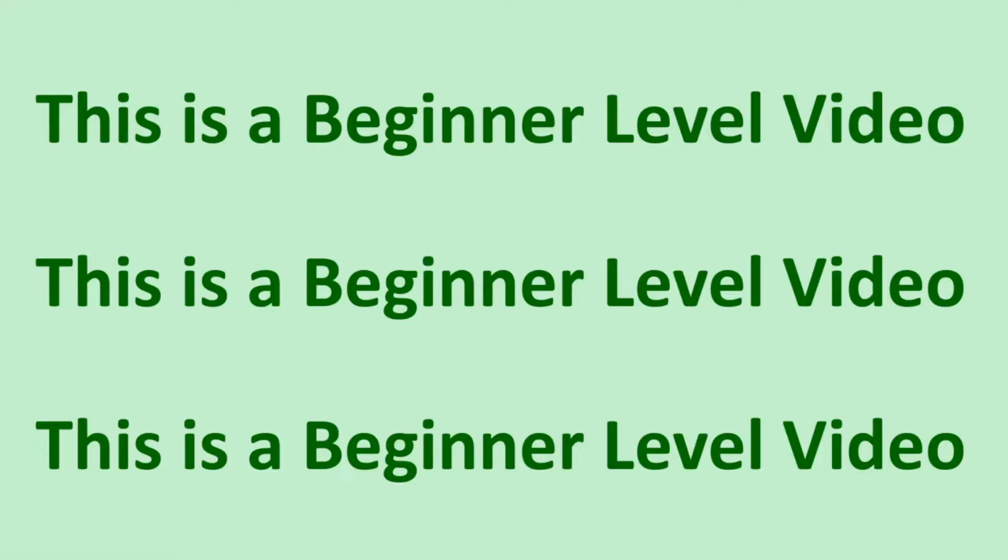And so, yeah, so let's get right into it. So, basic programming is the goal of this video is to take the code base that we've already developed, and we just need to get the robot moving. We're going to go into more detail in the future with different videos showing how everything works. But for now, this is just a beginner level video, and so we just need to get this thing moving so we can actually start doing some liquid movement.